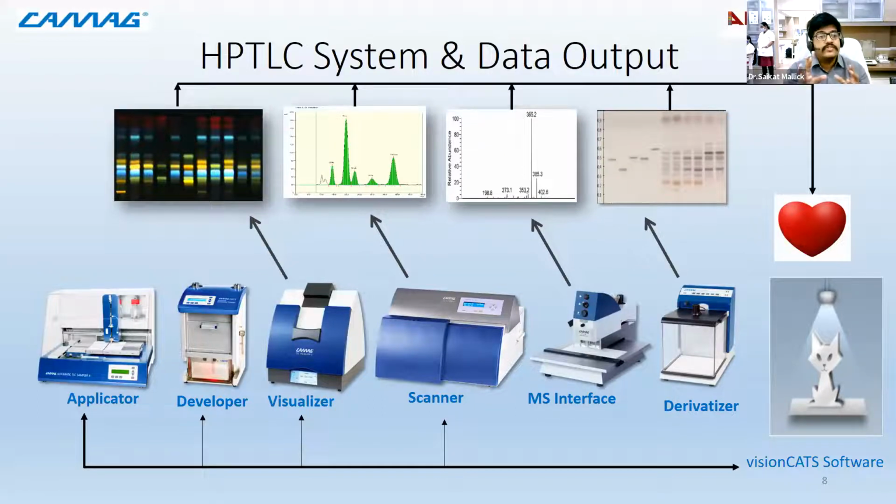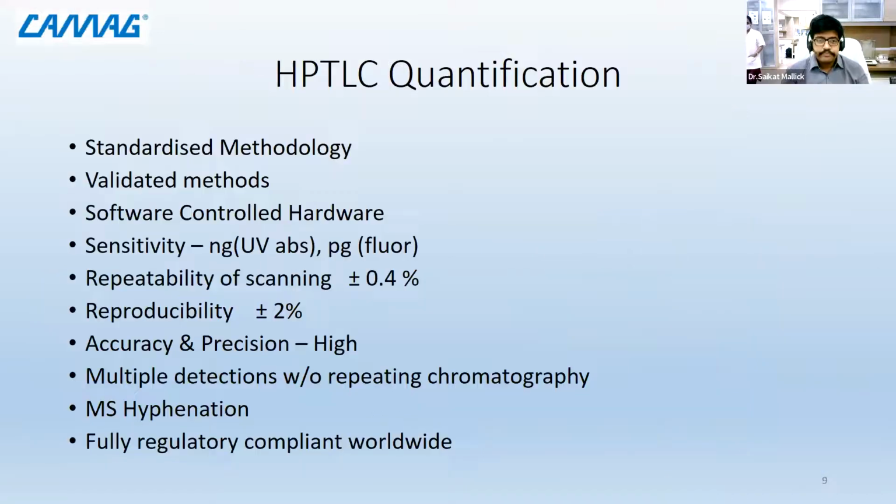So as I told you, 21 CFR Part 11 requires you to have total control on the instrumentation and log details like who is doing what and everything. So that is taken care of with the help of this software.